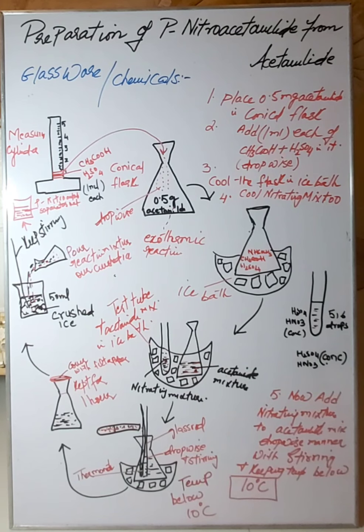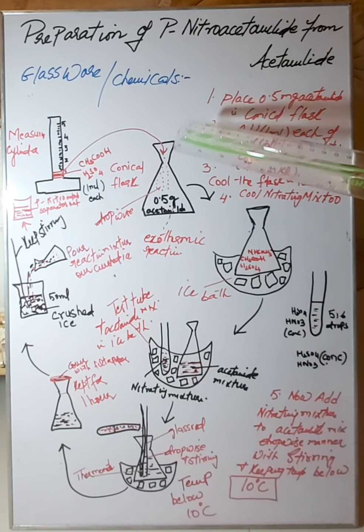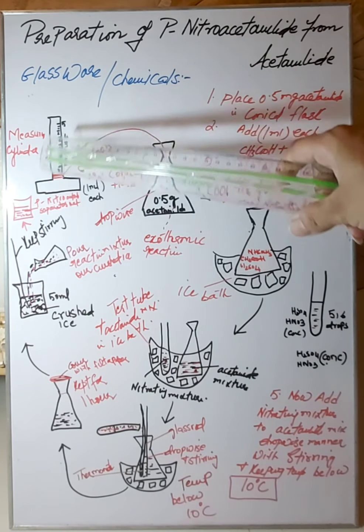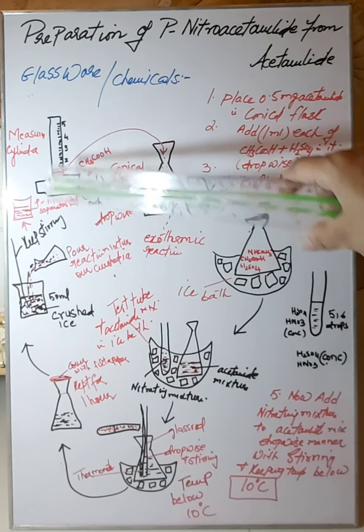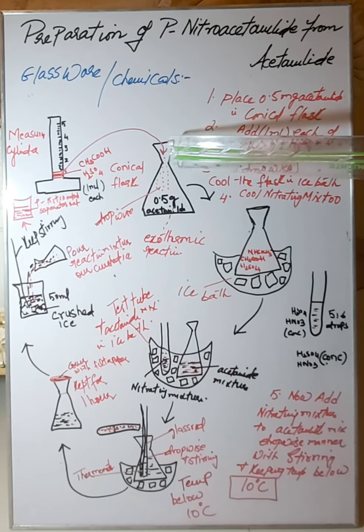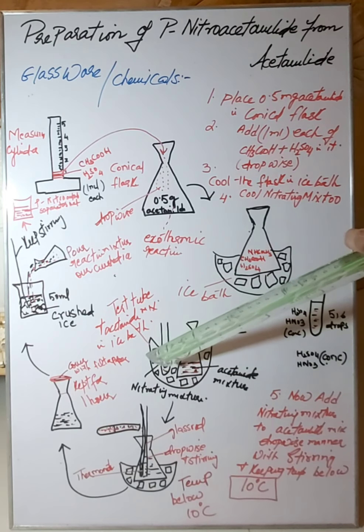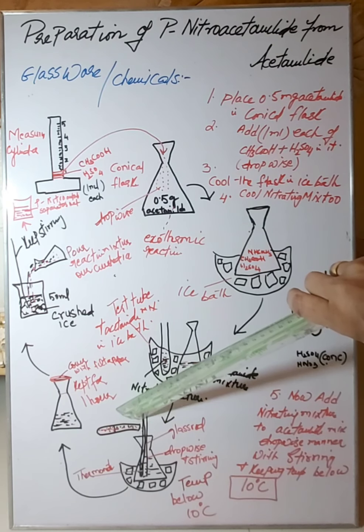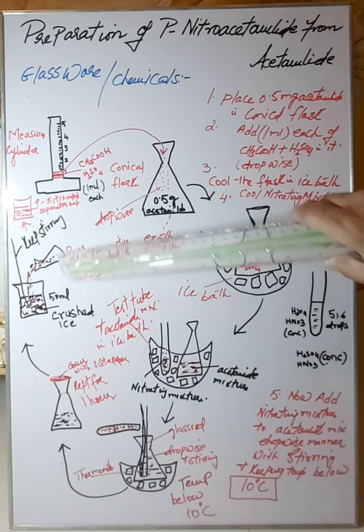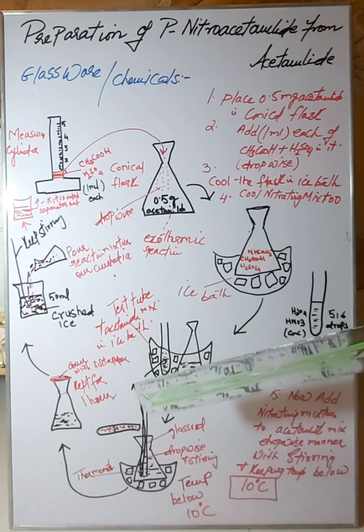Today I'm going to explain the preparation of para-nitroacetanilide from acetanilide. The glassware and chemicals used in this whole process include a measuring cylinder in which you are going to measure your different chemicals. Then of course you will be needing a glass rod for stirring, a conical flask, a test tube, an ice bath or a water bath, a thermometer, some different sized beakers, and finally the filter paper and funnels.